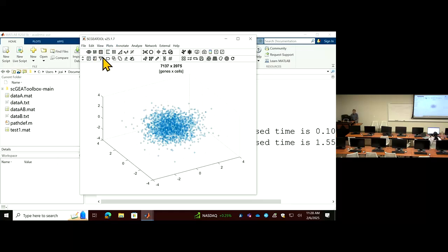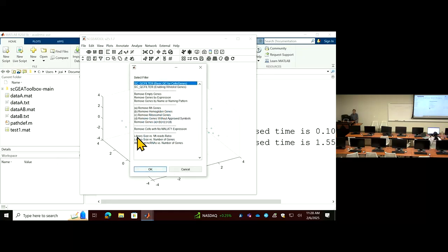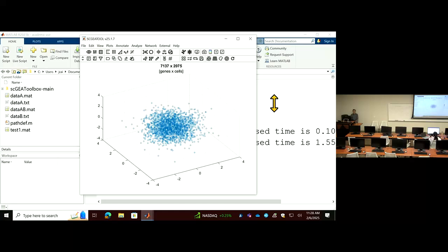So you want to do a QC using the library size versus the MT gene ratio. If you select this, it will generate a scatter plot for you to visualize these two statistics across all the cells. This will be a scatter plot.